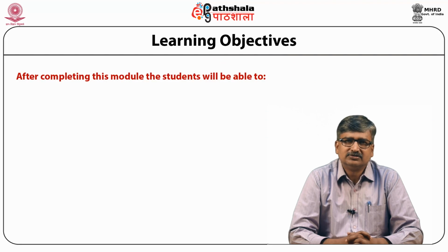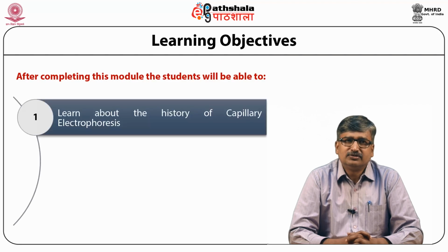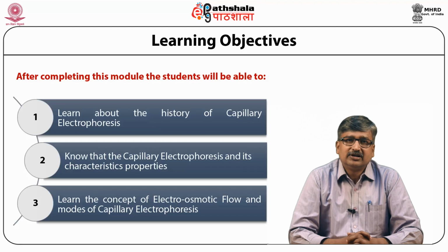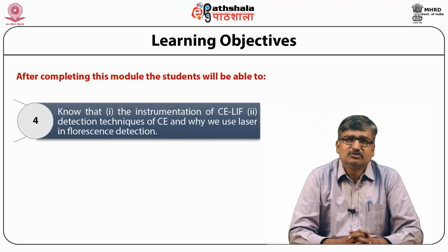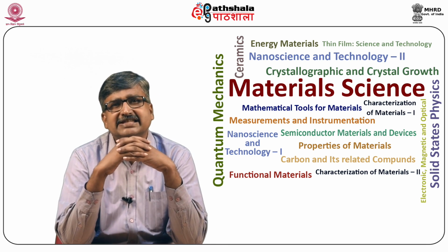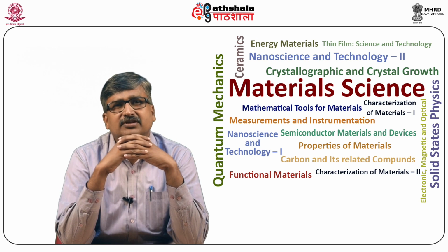After completing this module, my dear student, you will be able to know the history of capillary electrophoresis. You will also know capillary electrophoresis and its characteristic properties. You will learn the concept of electroosmotic flow and modes of capillary electrophoresis. You will also know the instrument of CE-LIF, the detection technique of CE, and why we use laser-induced fluorescence as a detector.